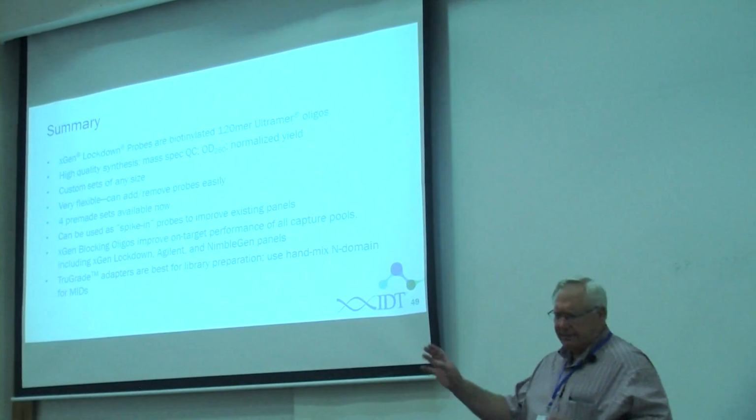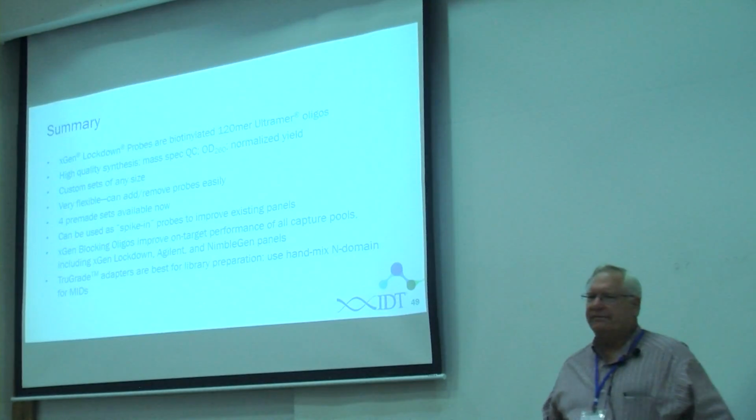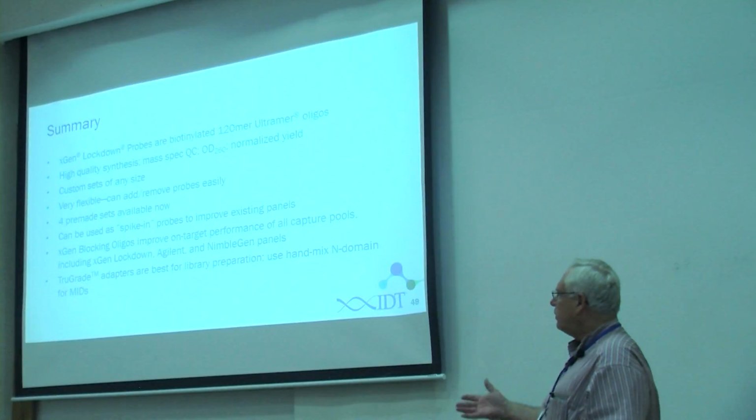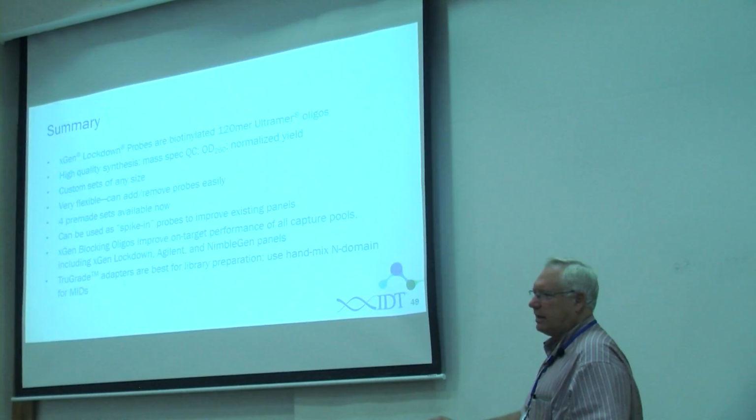So a lot of this stuff has been basics of oligo work that you probably don't normally think about. And I'm hoping that walking you through this will make it easier for you to think about how to obtain these things in the future when you need them.